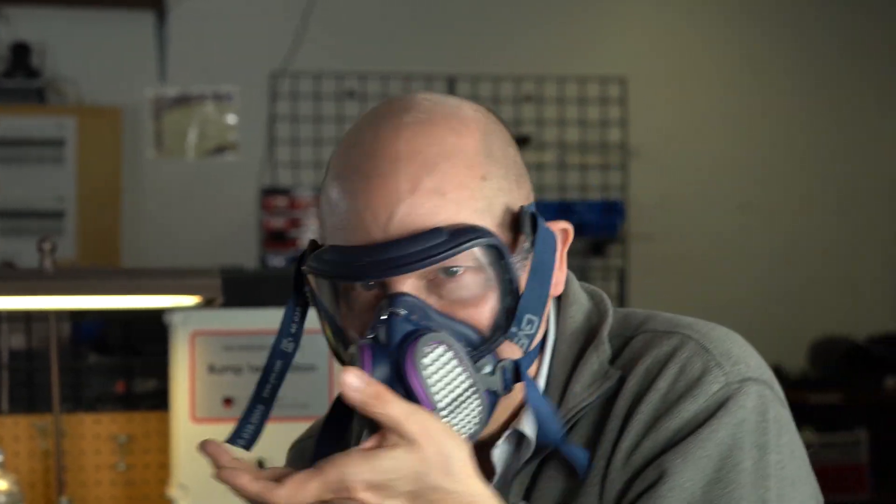When you do put your mask on, make sure you do that check on the fit. You can also try to block off your exhalation valve and blow outward. It shouldn't allow you to blow out and the mask should puff up a little on your face. If you feel leakage, that means you got a bad seal. I'm going to block the exit port — I can't do it. And that's what you want. It's either a negative or a positive check when you put your mask on — that's an important thing.